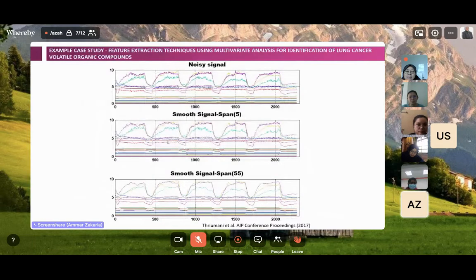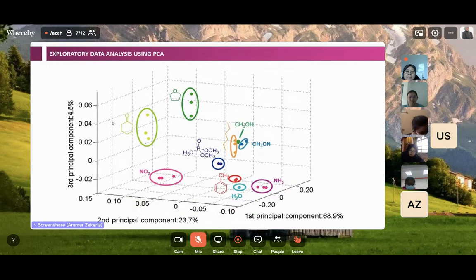Once you receive this signal, you extract the peak, you tabulate it in a graph, then you apply PCA, Principal Component Analysis. Then MATLAB will do it nicely for you. It will group the gases within correlation.